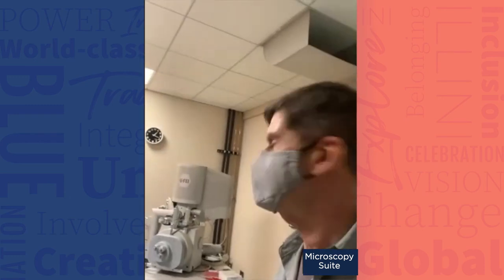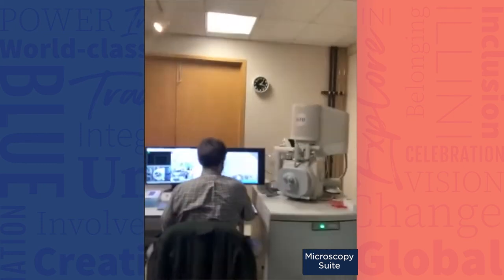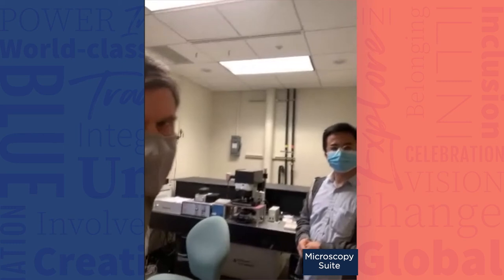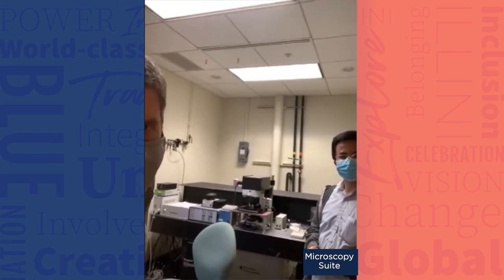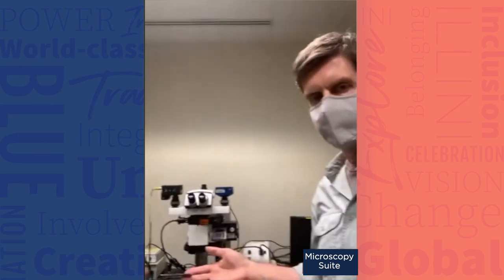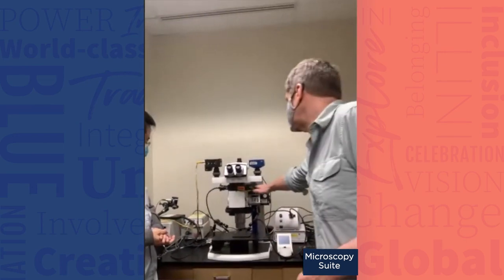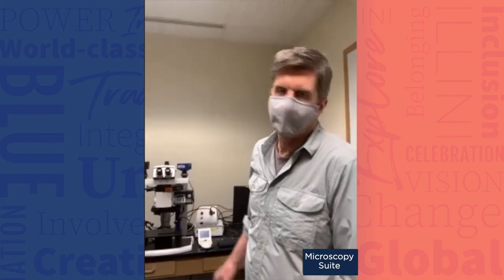You can work with wet samples, frozen samples, lots of different things — it's a really nice field emission microscope. We also got a Horiba Raman confocal system; somebody is using the confocal Raman system right now. We got this other system with DPV — it's a really nice system, also set up for fluorescence, and it has a 120,000 frames-per-second camera.